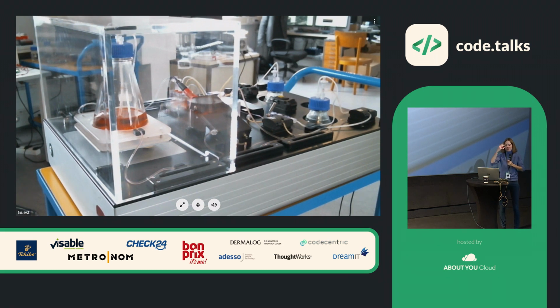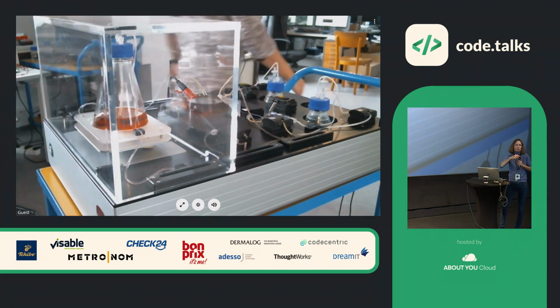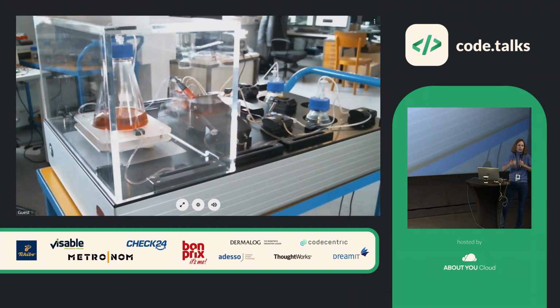But we are also working on bigger machines. For instance, we are hooking up a machine from another company to our web application. They have a 2-liter machine that we're working on now, and then they have a 20-liter and a 200-liter, so that we could scale up. We are not doing the mechanics ourselves. We are just doing the electronics and the software, and we let them build the mechanics.